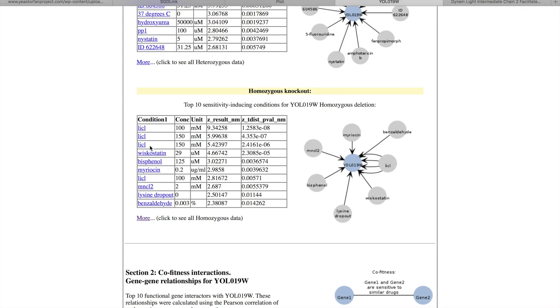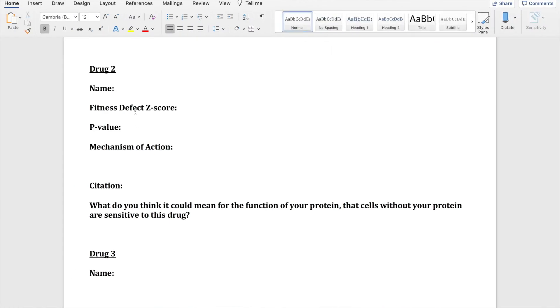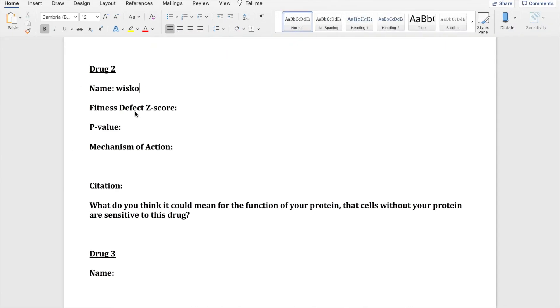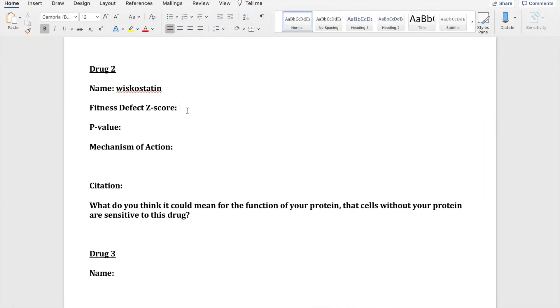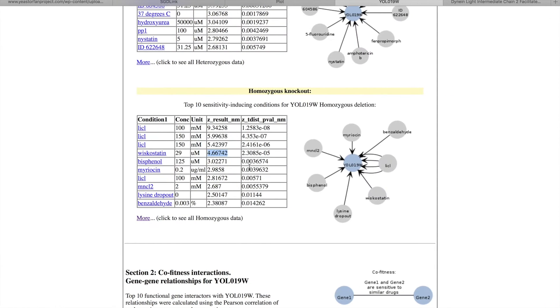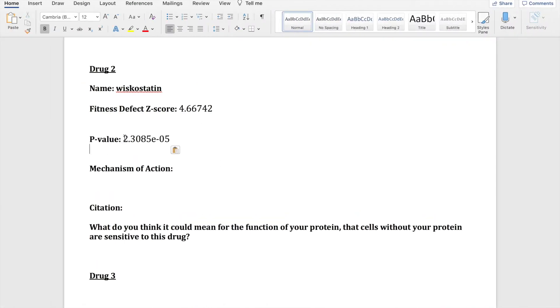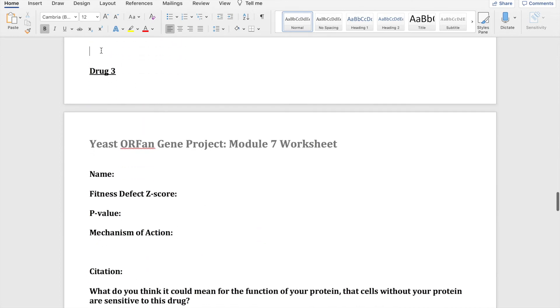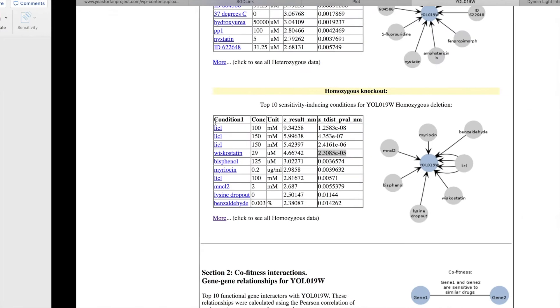So I went a little bit out of order, but now I'm moving on to drug number two, and that drug is going to be wiscostatin. So the fitness defect z-score, copying and pasting that. The p-value, copying and pasting that. And again you would look up the mechanism of action and talk about how it could affect this, how the drug could affect the cell.